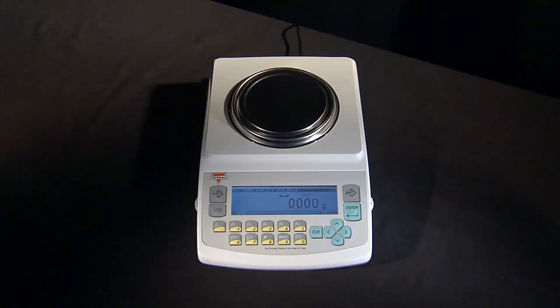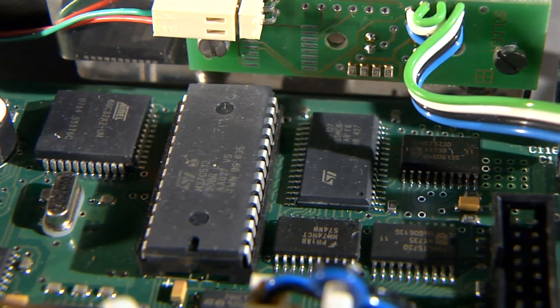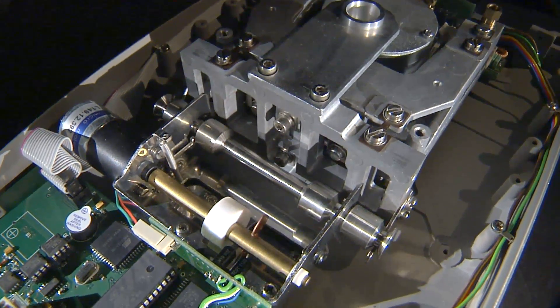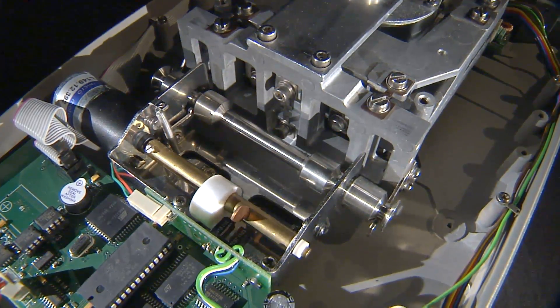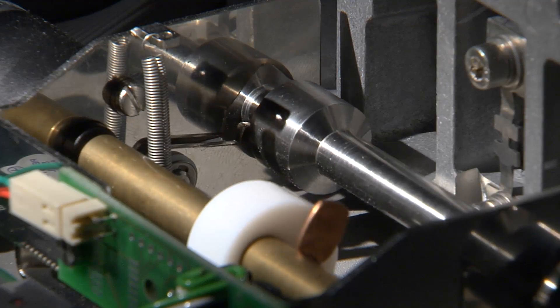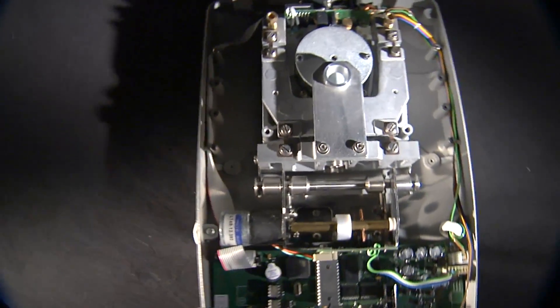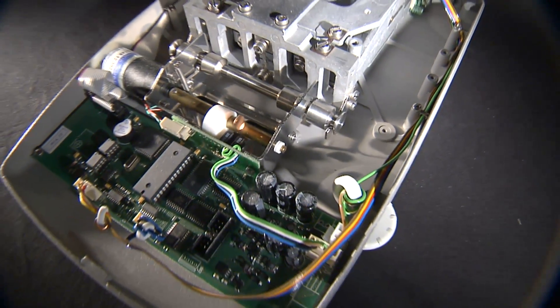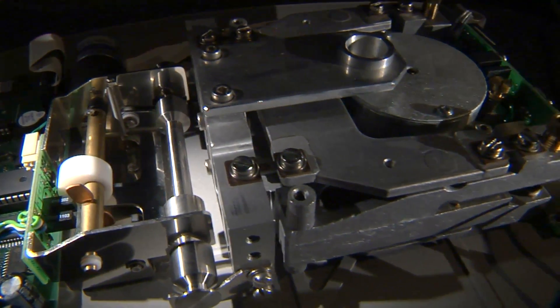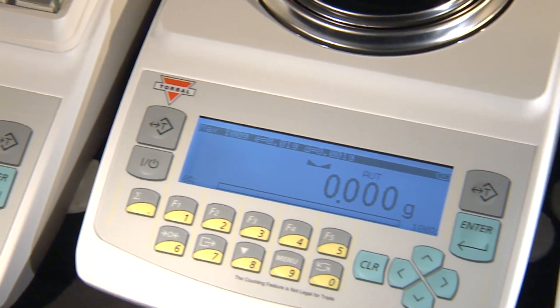Just like the AGC series, the AG is equipped with a fast 32-bit processor and automatic internal calibration that provides optimum weighing accuracy at all times. The automatic internal calibration mechanism calibrates the scale at startup, at preset time intervals, or whenever required by internal temperature changes.